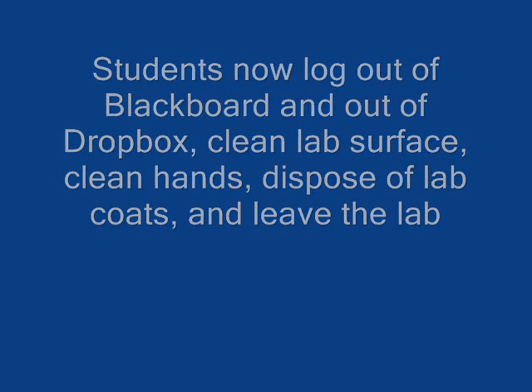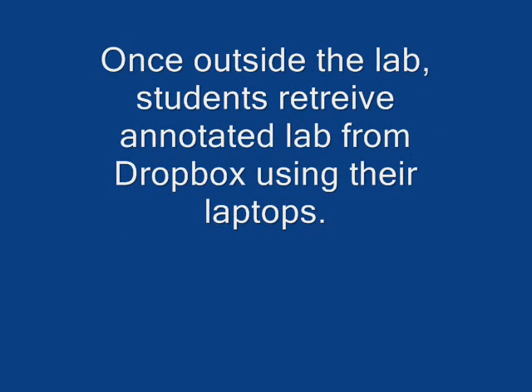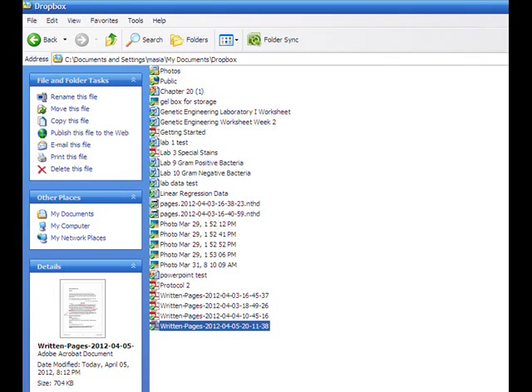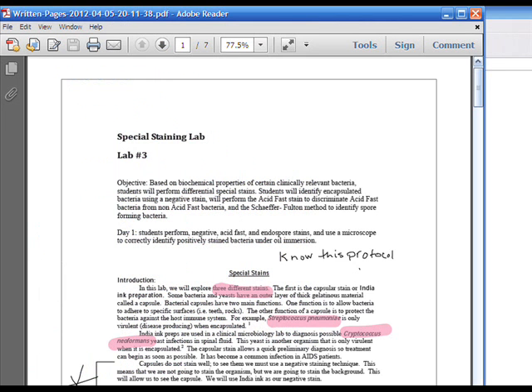Once the students leave the lab, they're able to open their Dropbox account on their laptops and access the documents. Here you can see the document that includes the highlights, notes, and data the student collected. Each of these objects can be selected and copied out to a Word doc as the student assembles a lab report.